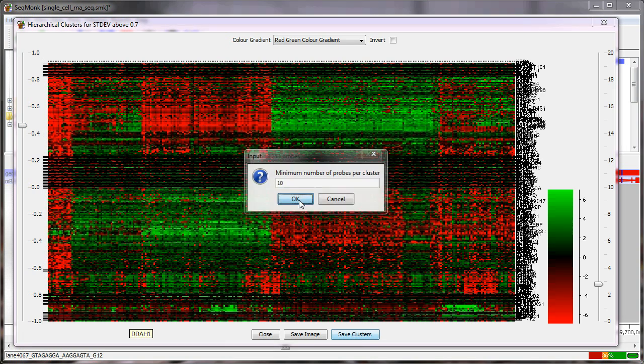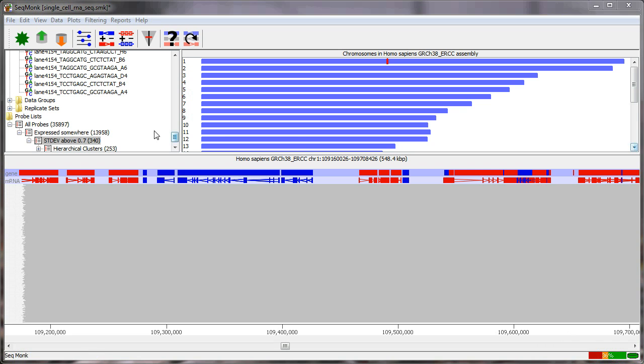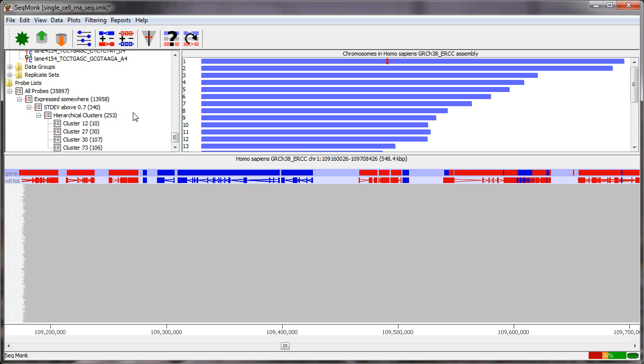So if I save my clusters, I've actually got a fourth one that's come in. There must be another smaller one in there, but I now have the two major groups of genes which I saw, the third smaller cluster, and there must be a fourth very small cluster that came through from one of those sets. This immediately gives me something that I can start relating to biology, because each of these clusters now should have a similar expression profile across all of my samples.